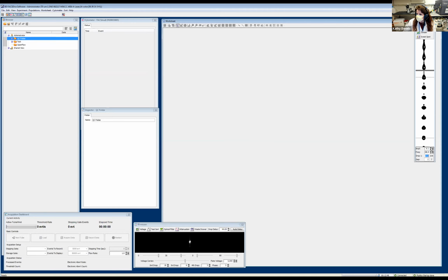So if I'm coming in and I see that this value for drop one is way off, right? That was because I just made this change to the amplitude and I went down one whole value, okay? What happens on the ARIA, which is nice, is if I hit the control key and any arrow, it makes changes of one whole integer. So if I were to come in and see this, I have 2 options, because I see that I want the drop one to be at about 211, and the real value is reading at 157. My gap is okay, but my drop one is not where I want it to be.